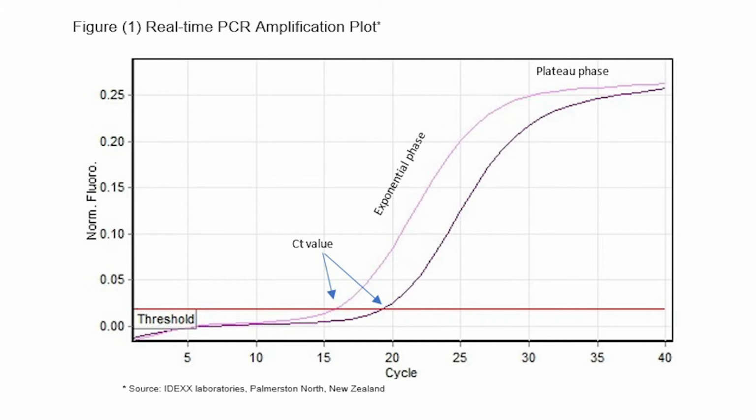Quality control is mandatory for our real-time PCR to ensure optimum performance. Nucleic acid extraction control, pre-analytical control, and post-analytical controls are always included with each sample.